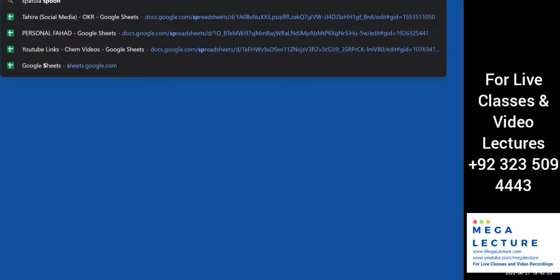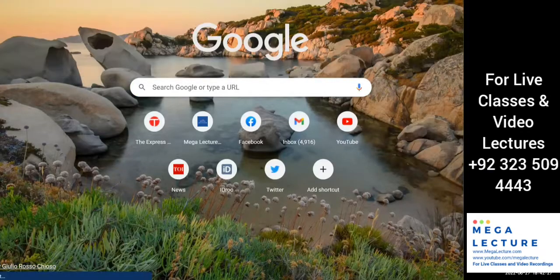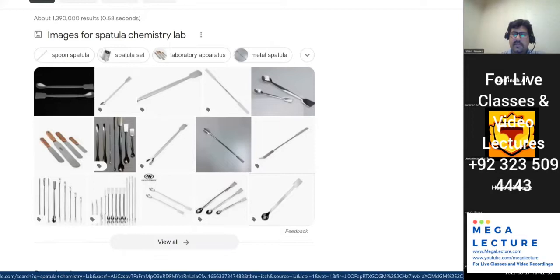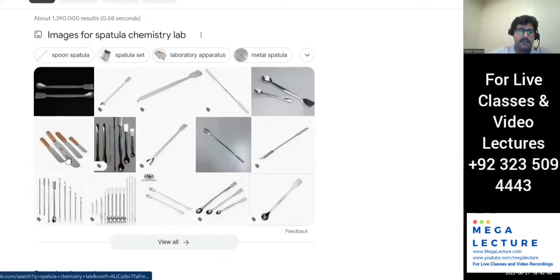A spatula basically looks like a spoon — that is what a spatula looks like. They come in different sizes. And that's about it.